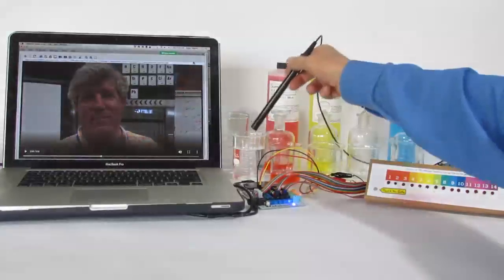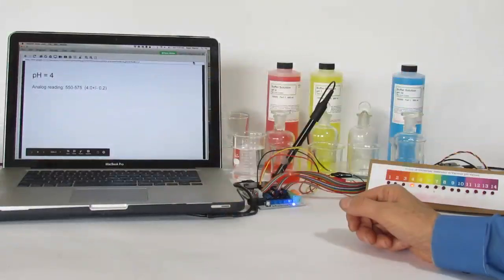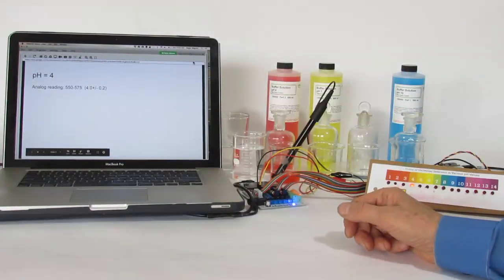Move it to one with pH 4 and the display changes in Google Slides to pH 4.